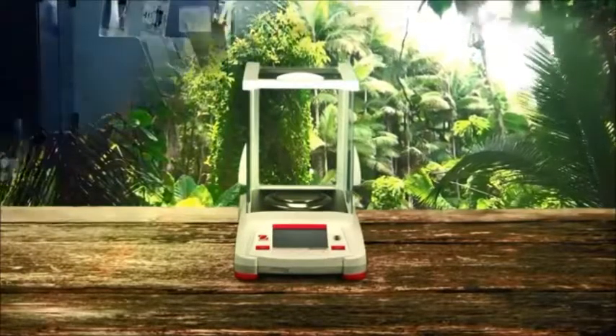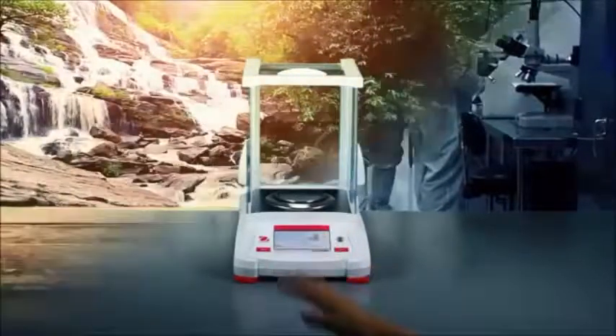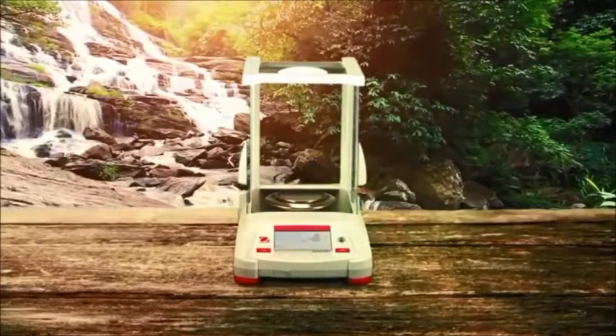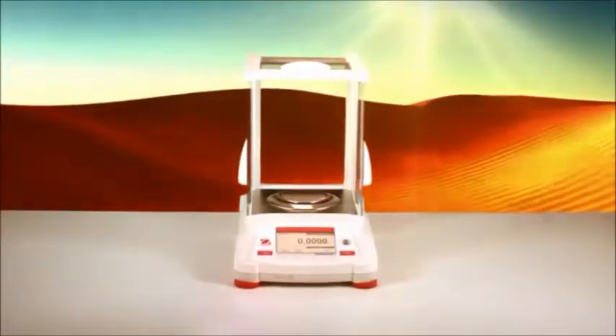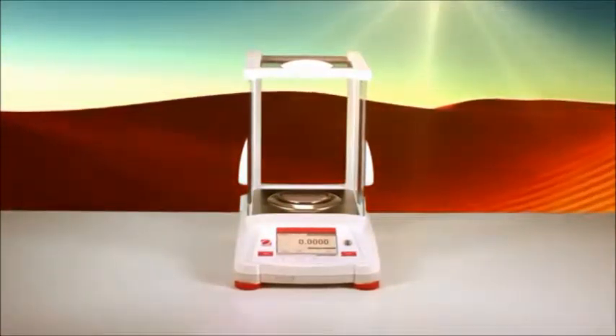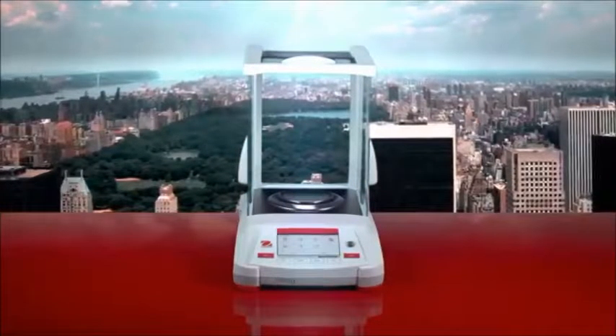It's about the journey and the destination. The all-new Ohaus Adventurer has been carefully designed to meet your needs anywhere in the world — efficiency, simplicity, and innovation all in one exceptional balance, featuring an intuitive color touchscreen.